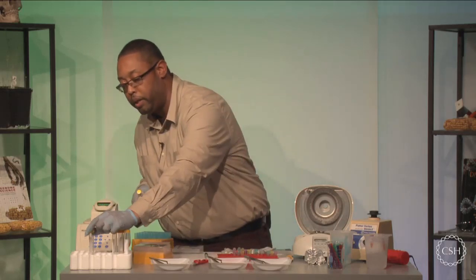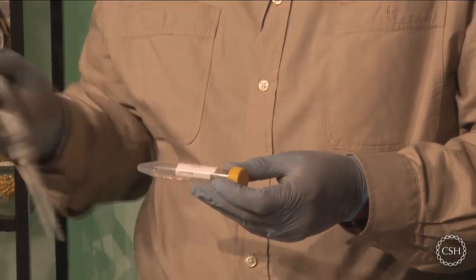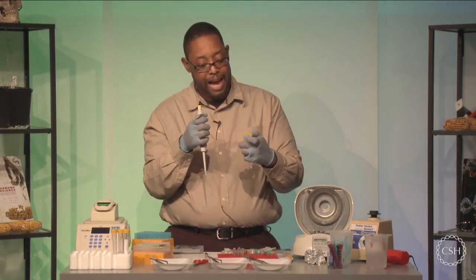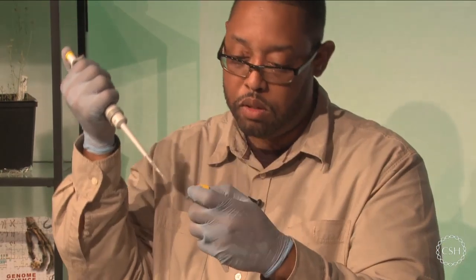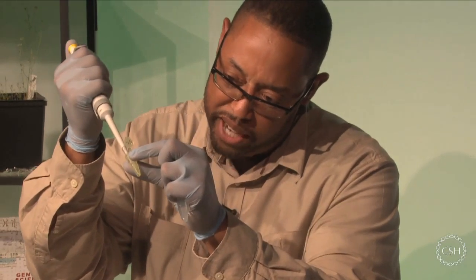And to do that, we can use water or dH2O. You can choose to use Tris and EDTA or just Tris at 10 millimolar. So with my P100 still set to 100 microliters, I'm going to add 100 microliters of distilled water into each of these test tubes. I'm going to make sure I add my water directly to the pellet.